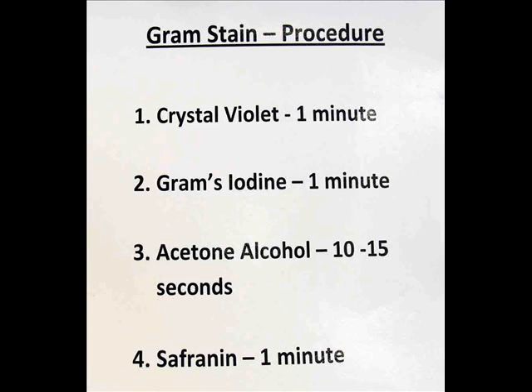My last step is going to be applying Safranin. This is a counter stain. My Gram negative bacteria don't have any stain in them at this point. And I need to add a stain so I can see them under the scope.